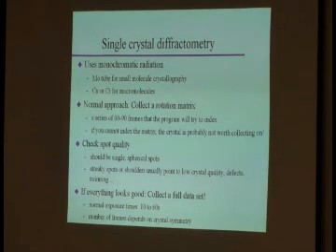How do you usually do your experiment? Well, you usually start with what is called a rotation matrix, okay? And Chris is nodding, he has done that already probably. So you put a crystal on, you tell the instrument to collect a matrix, and that is the reason why nowadays we no longer do those Weissenberg, oscillation, precession methods, okay? That matrix, 60 to 90 frames, exposure time depends on how strongly your crystal scatters. It takes you, what, about 15 to 30 minutes to get that one done.